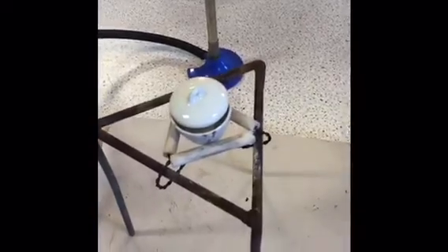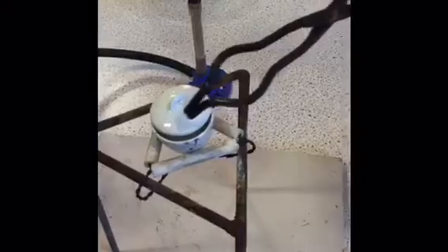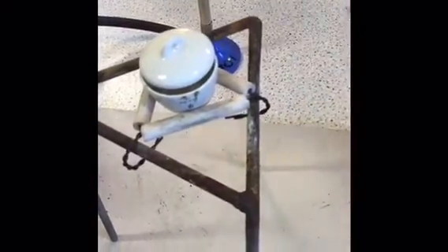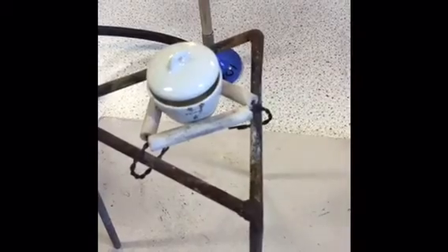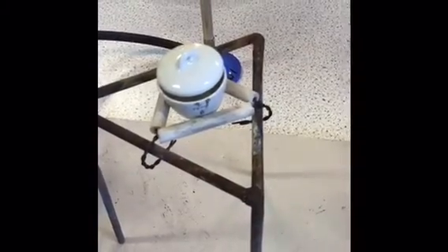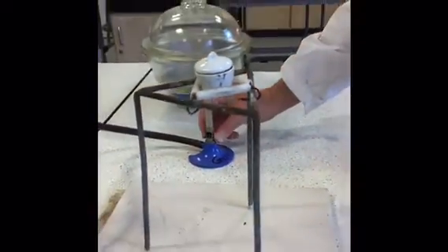Right, I'm now going to heat up the barium chloride salt to drive off the water. Now you'll notice that the lid is not entirely covering the crucible, just to allow a little bit of space for the water to escape. Now it says you should heat it gently for the first 2 minutes. To heat it gently, it doesn't mean you use a yellow flame, you still use the blue flame as always.